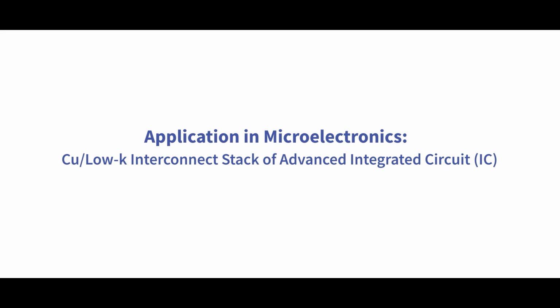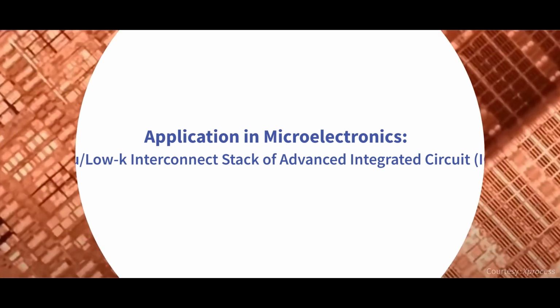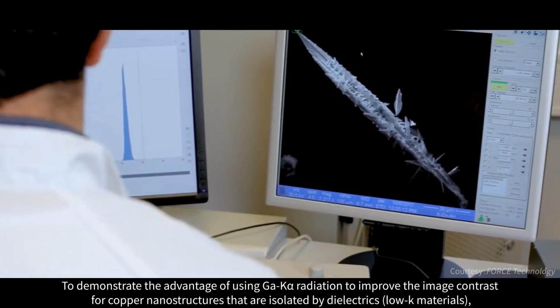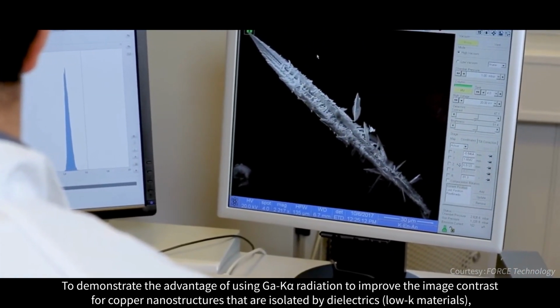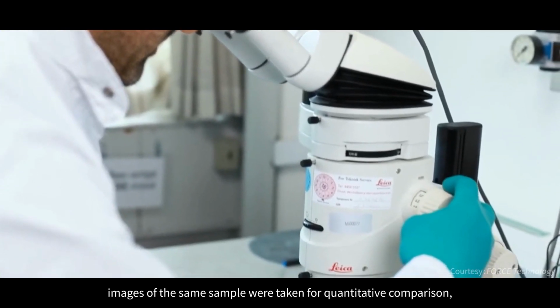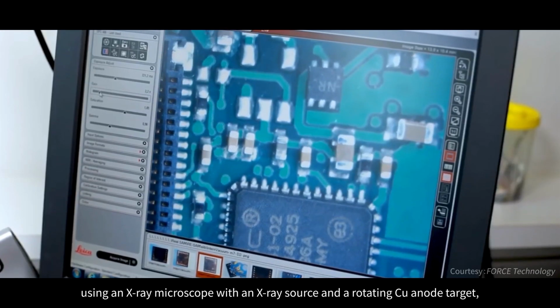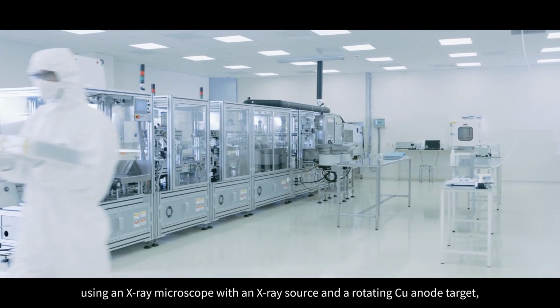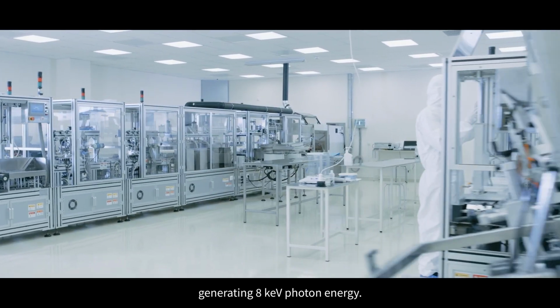Applications in microelectronics: copper low-K structure of advanced integrated circuit. To demonstrate the advantage of using gallium K-alpha radiation to improve the image contrast for copper nanostructures that are isolated by dielectrics, images of the same sample were taken for quantitative comparison, using an X-ray microscope with an X-ray source and a rotating copper anode target, generating 8 keV photon energy.